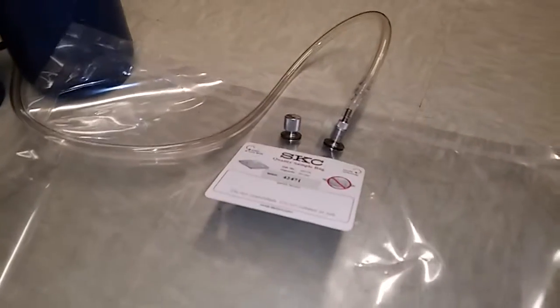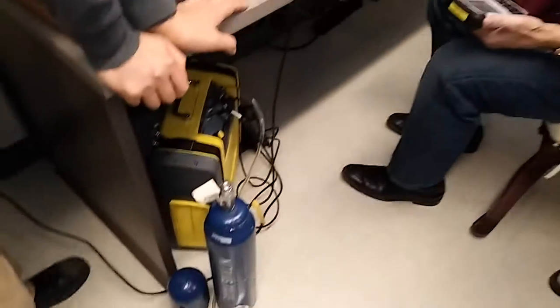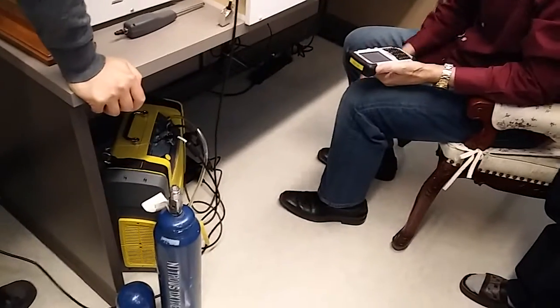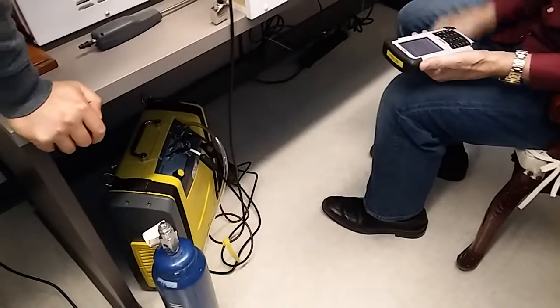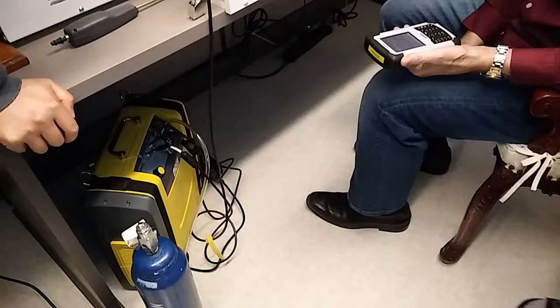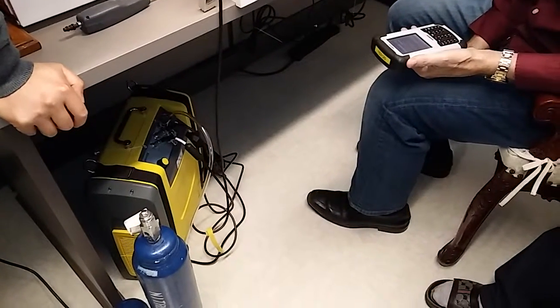Connected? Yeah. Valve is open? Yeah. Okay. So let's see what happens to the values after it goes through a cycle. This will help purge the cell too. It'll clean it off.